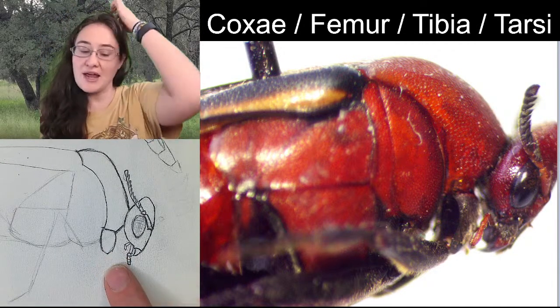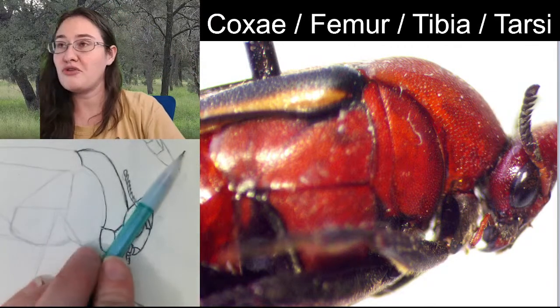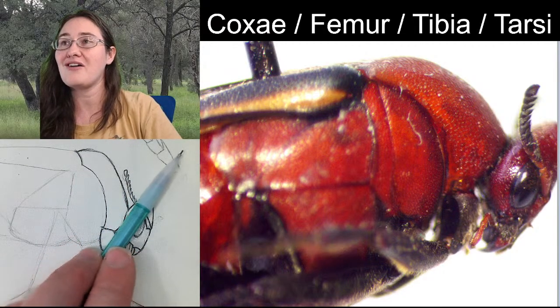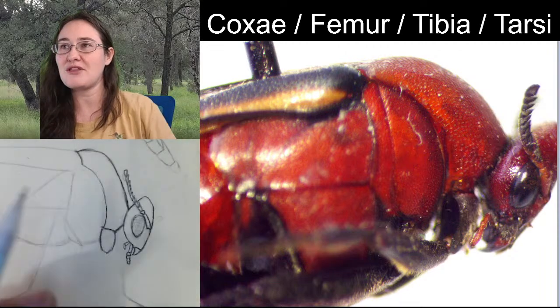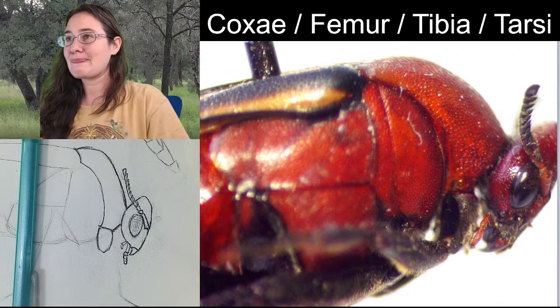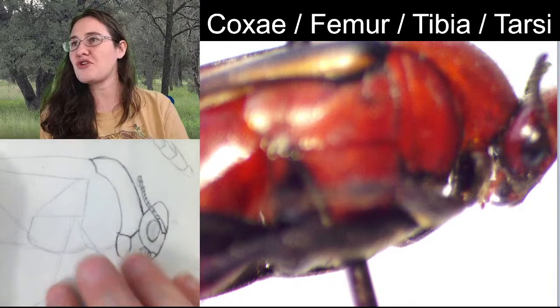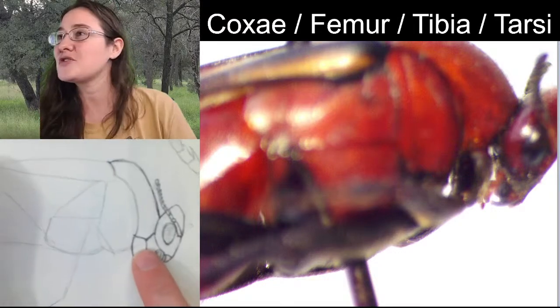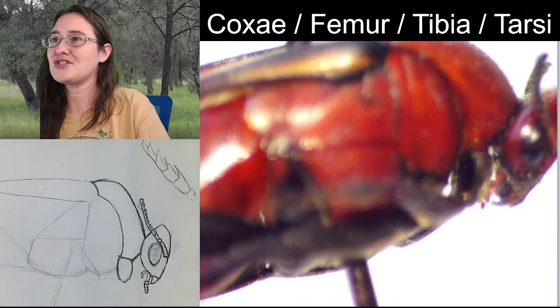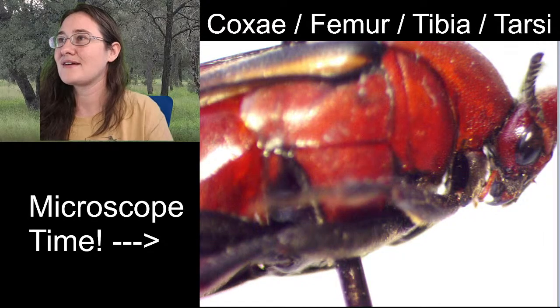All right. Now, at this point, you can choose to move your femur forward or your femur backward. Although, a natural pose would be the beetle's femur going in the forward direction. Actually, let's go ahead and finish the thorax, and then we'll add the legs. So at least we know where the legs are going to be connected. And I changed the focus. There we go.